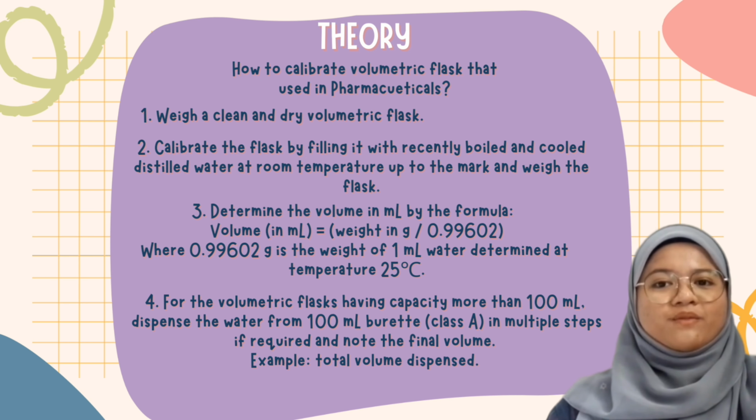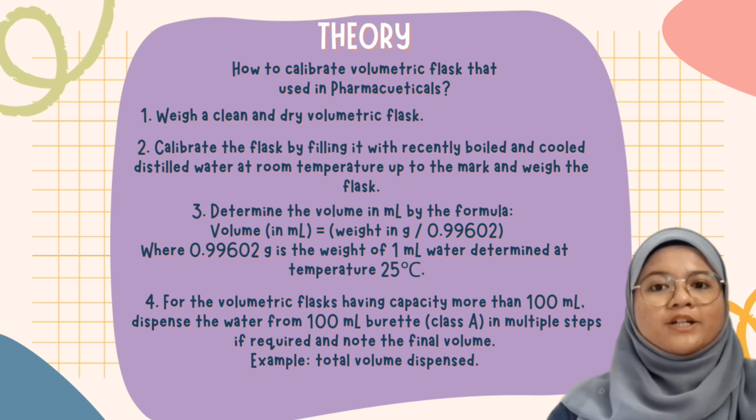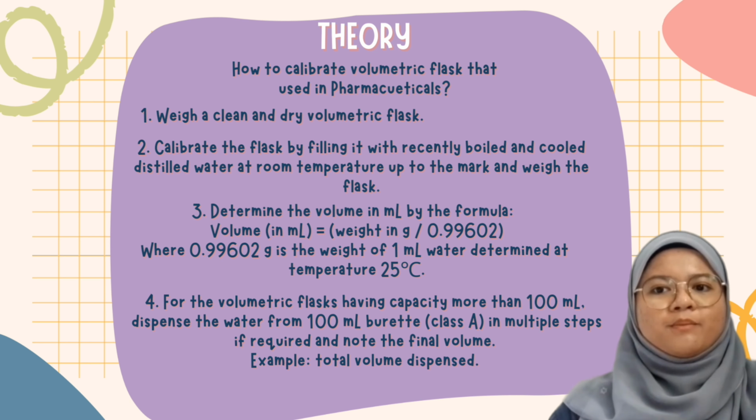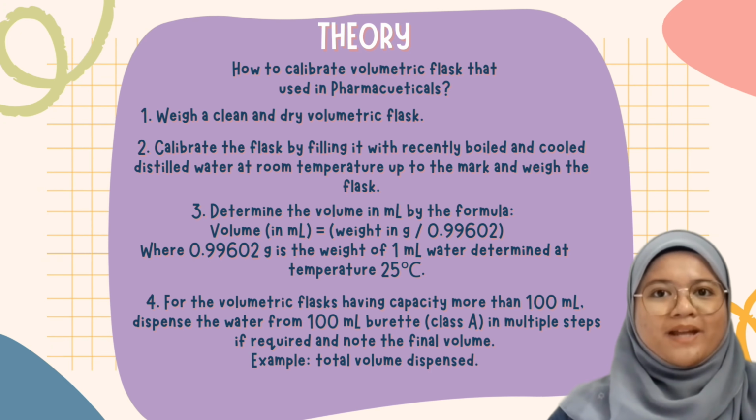For a volumetric flask having capacity more than 100 ml, dispense the water from a 100 ml burette class A in multiple steps if required, and note the volume. For example, total volume dispensed.